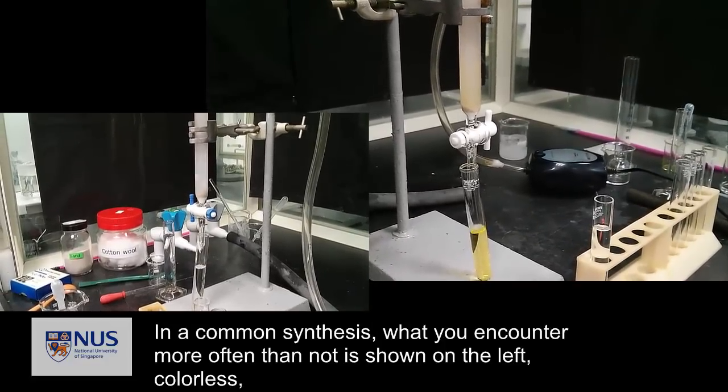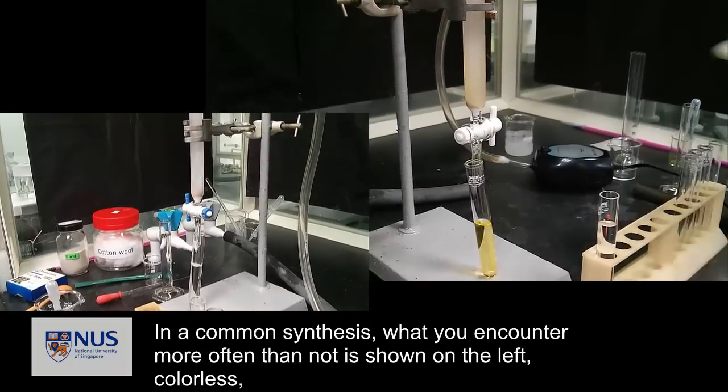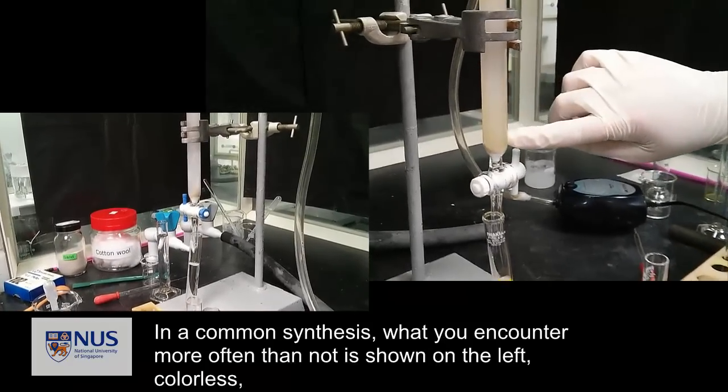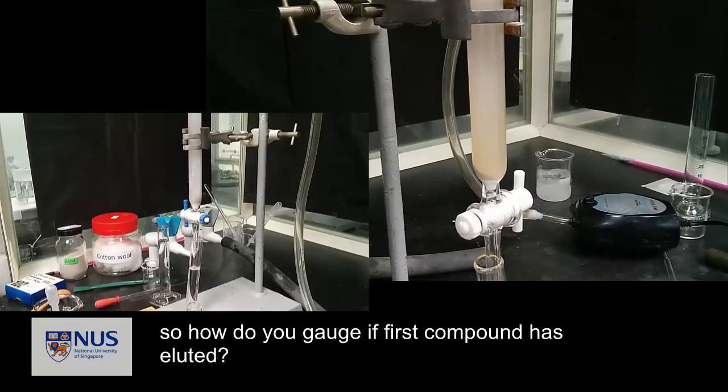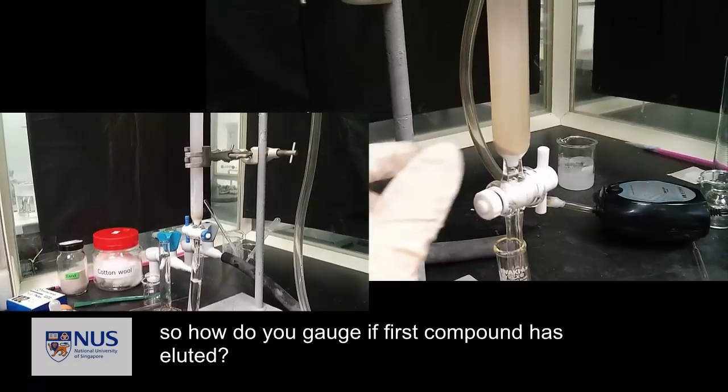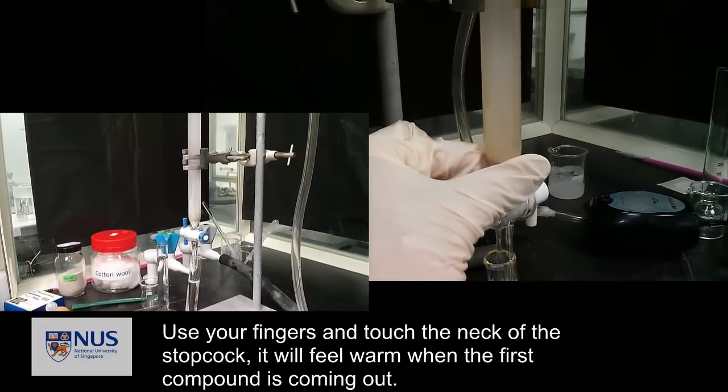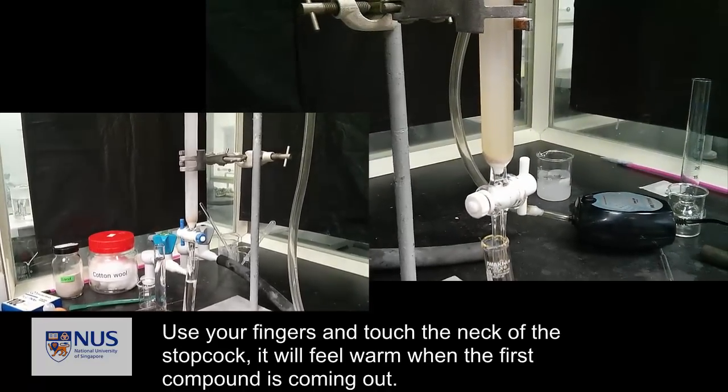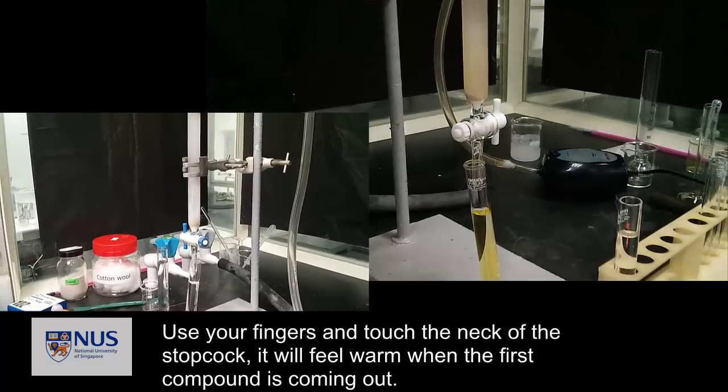In a normal synthesis, what you encounter more often than not is shown on the left—all colorless. So how do you gauge if the first compound has eluted? Use the fingers and touch the neck of the stopcock. It will feel warm when the first compound is coming out.